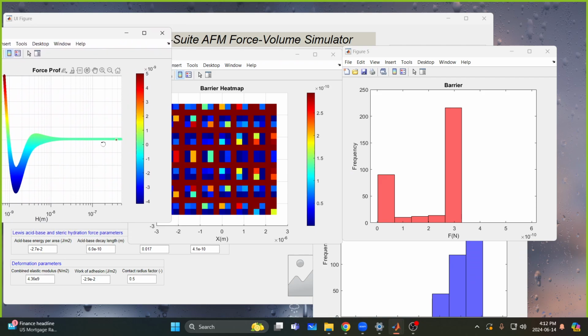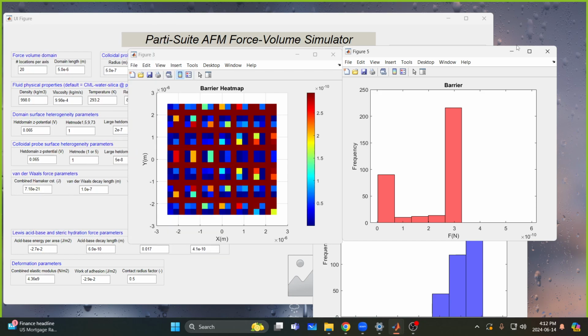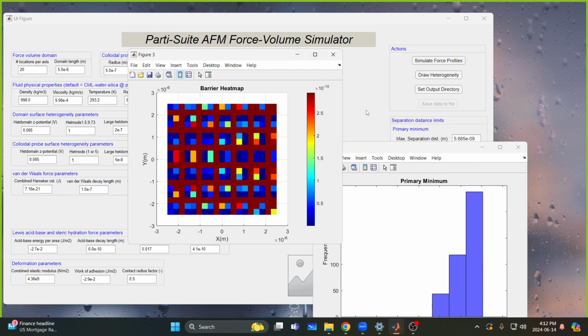So you can get the stats from all this. By the way, all of this is output in an Excel file. These images are really useful to play with, but you can generate your own stuff based on this output. Do you want to go through that real quick?